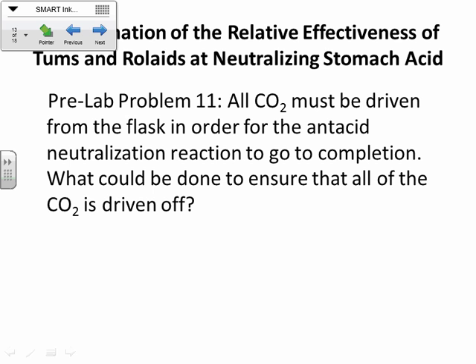Okay? Now, here's kind of something that you might not be thinking about, but when this student did this lab, there's CO2 in the air that dissolves into that water, okay? And that makes it more acidic. Now, you saw this because I breathed into the titration the day that I showed you as a demo, and it turned it back clear, okay? And so we've got to get all the CO2 out.